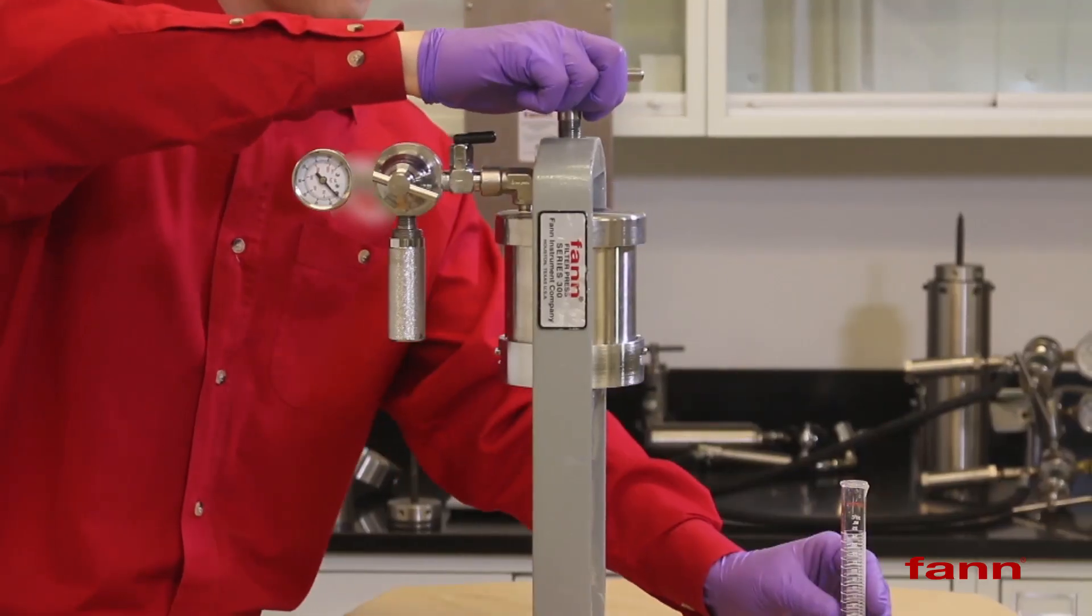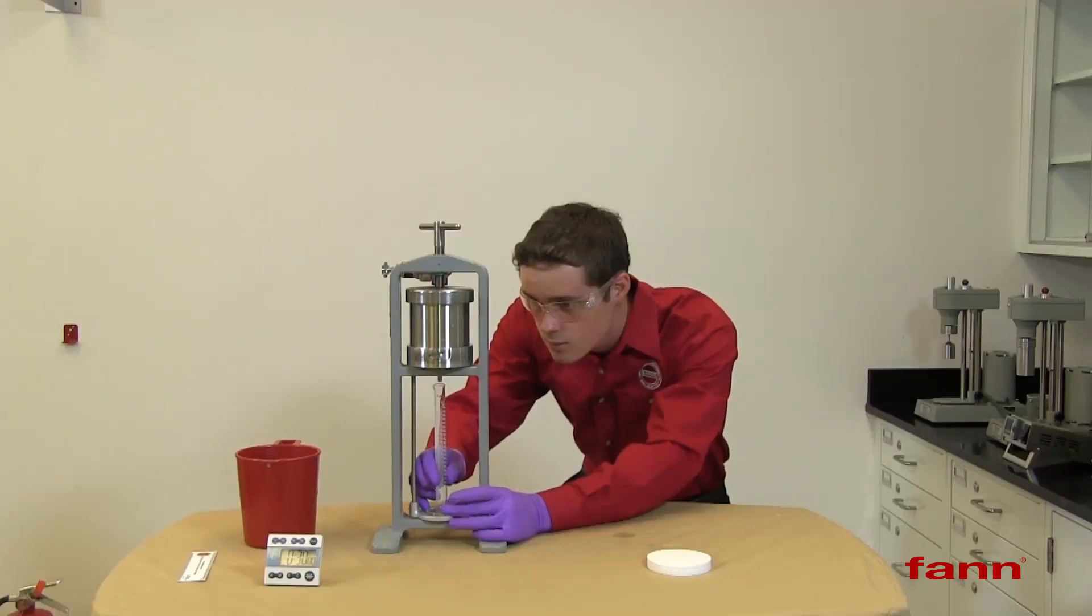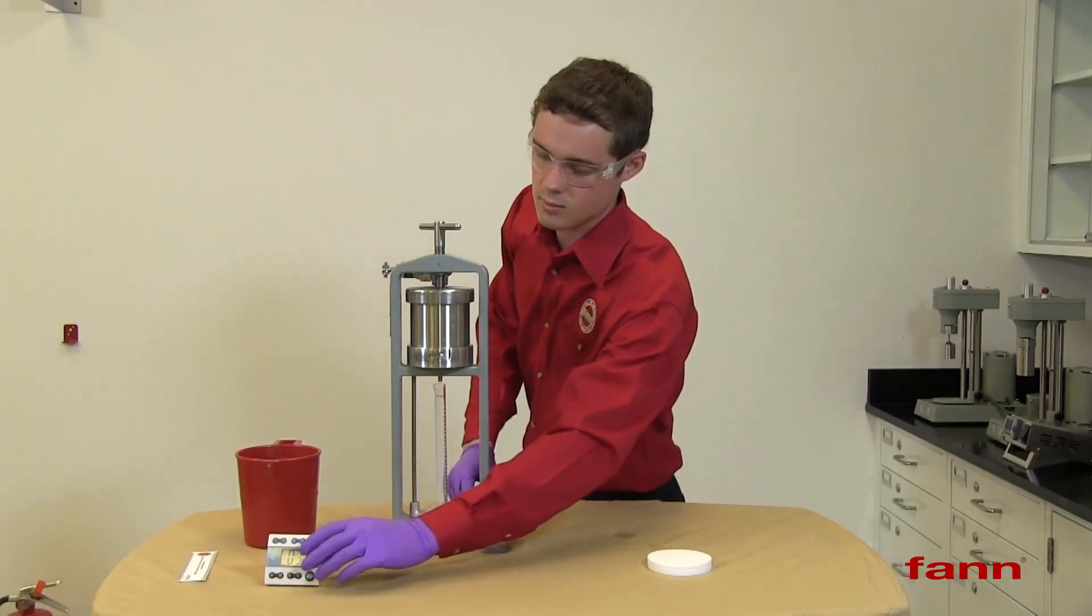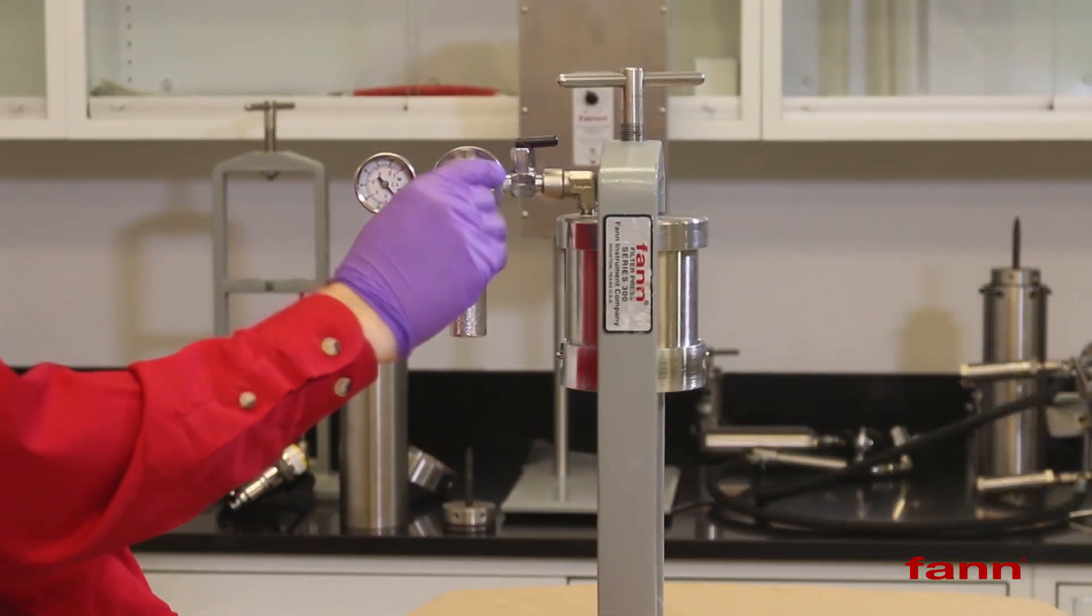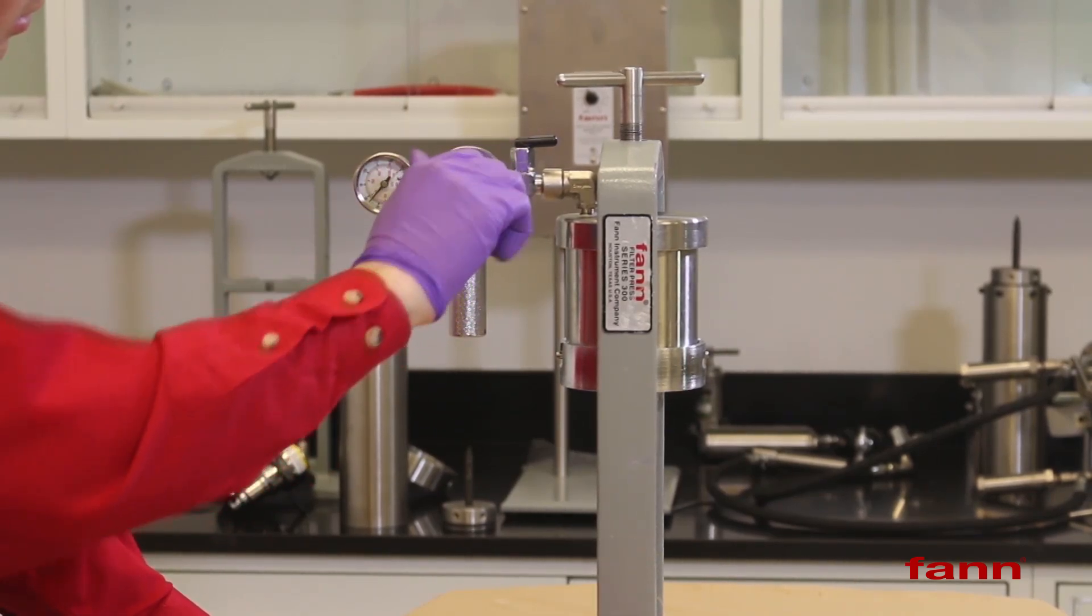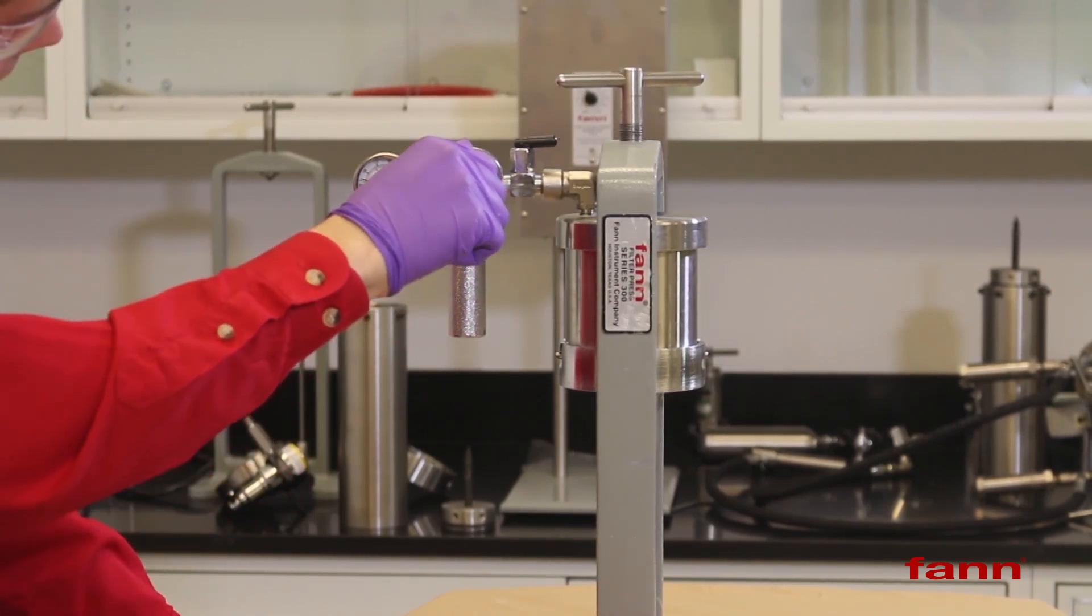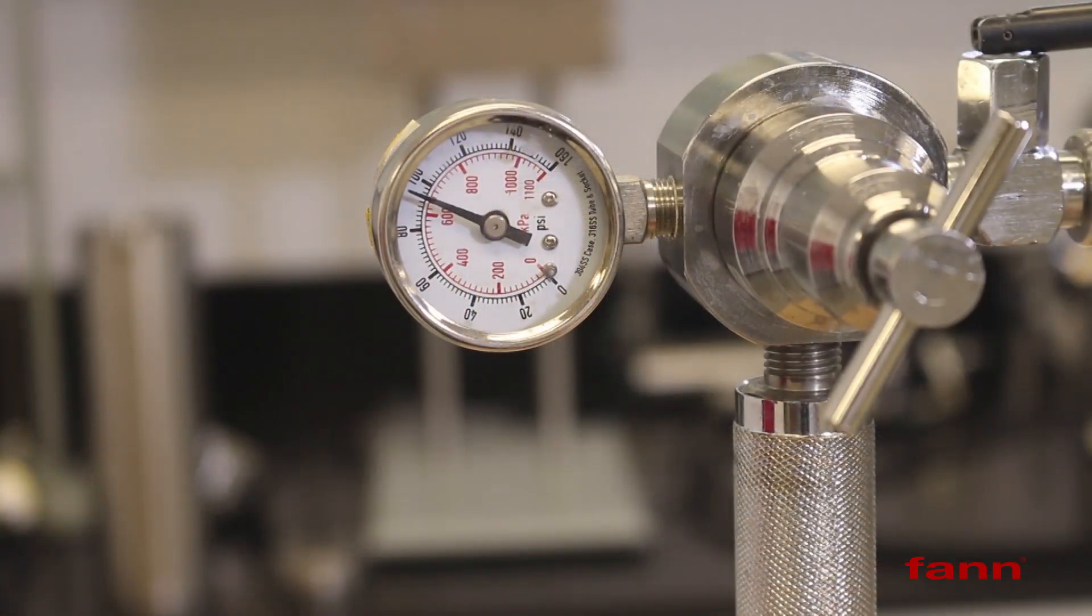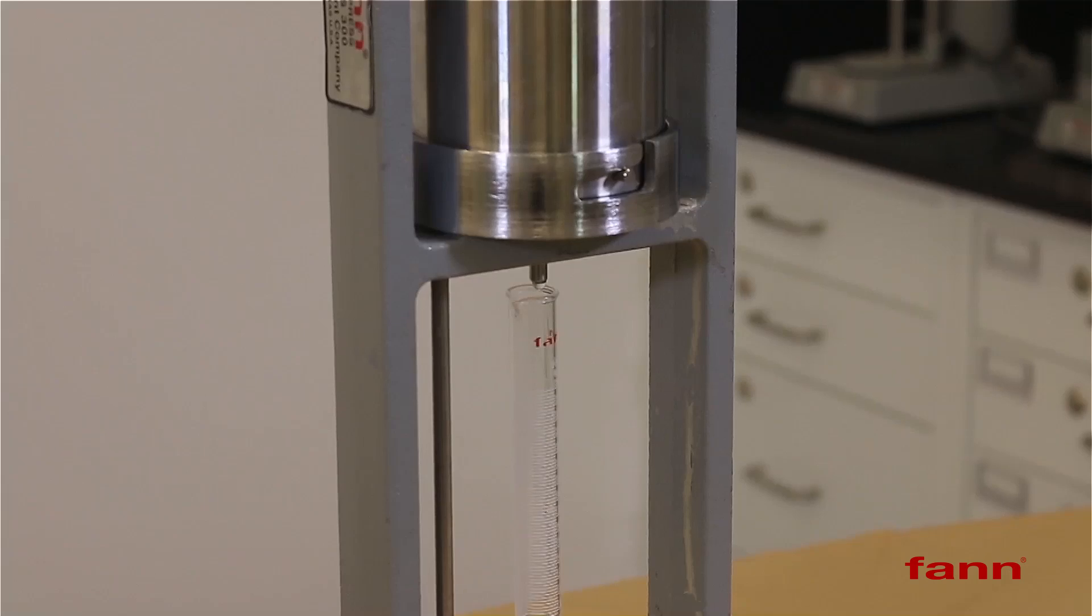Put a graduated cylinder underneath to collect the filtrate. Turn the regulator in to get 100 PSI on the cylinder as shown on the gauge. Set the timer for 30 minutes. Filtration rate is measured in milliliters of filtrate per 30 minutes of time.